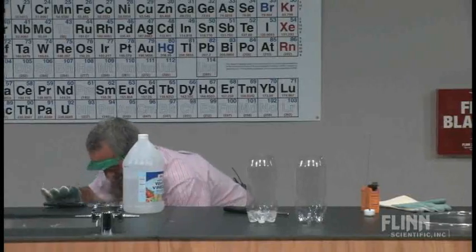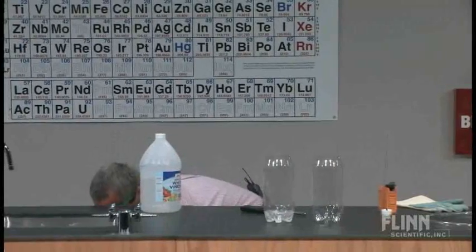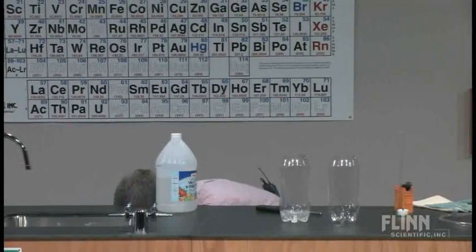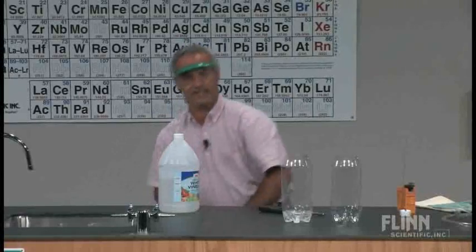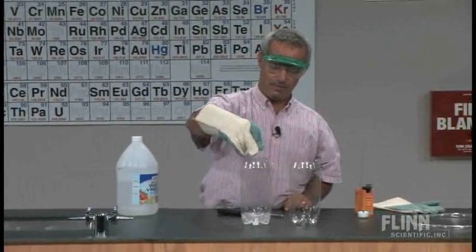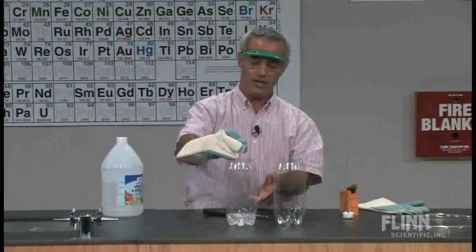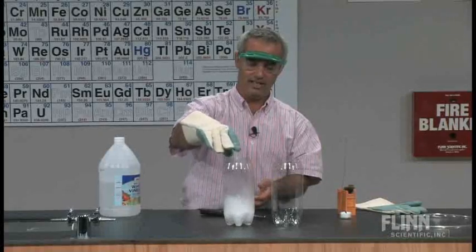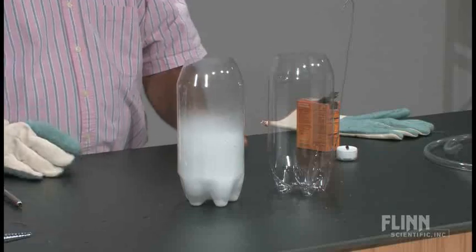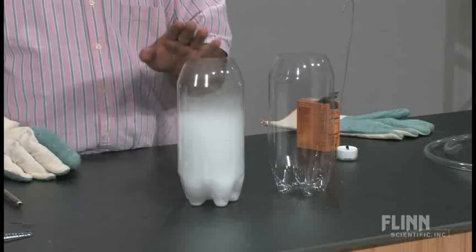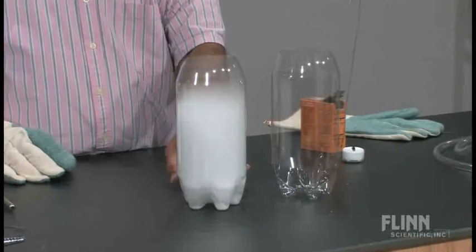And I've got some dry ice here. And remember the dry ice is solid carbon dioxide. So I'm going to put a few pieces in here.